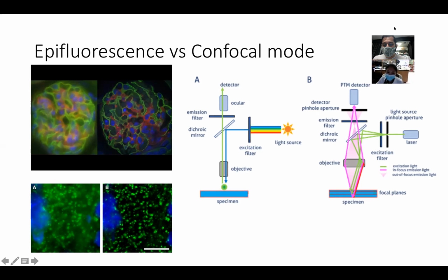And you said for the epifluorescence, there is no... Can you hear me? Can you bring the microphone closer? Yeah. Can you hear me now? That's much better. So you said that the epifluorescence also goes through the depth, but doesn't... Yes. Okay. So the light passes through the depth of the specimen for both the microscopy techniques. But in the epi, it doesn't have the pinhole that makes the other light go away. Kind of.